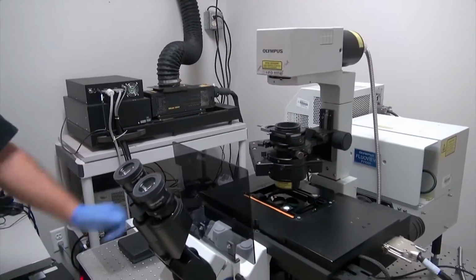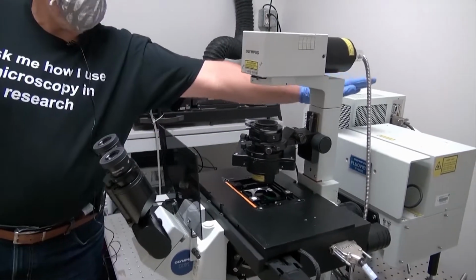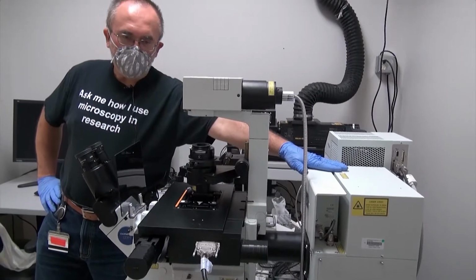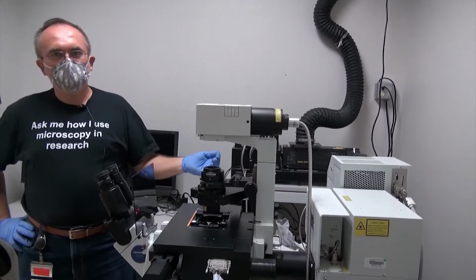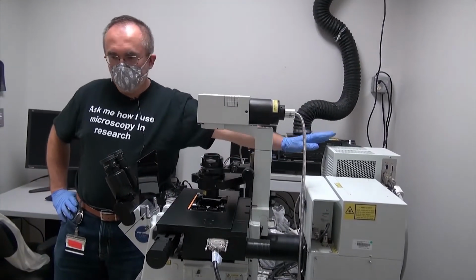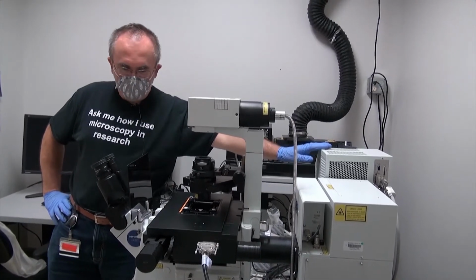It's equipped with a sensitive CMOS camera. For confocal imaging, back here in this box, there are 3 detectors. Some of them are spectral, so that we can acquire emission spectra of fluorescent dyes and do spectral unmixing. We also have 2 high sensitivity GaAsP detectors back here.